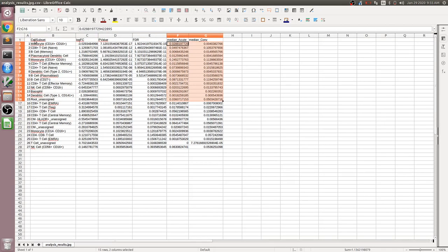So everything that you can access with the platform can also be accessed in this reports export, and it offers an additional wealth of information. You can load these files into Excel, into Prism, into R, and do any kind of follow-up analysis, any kind of follow-up visualization that you want to do.